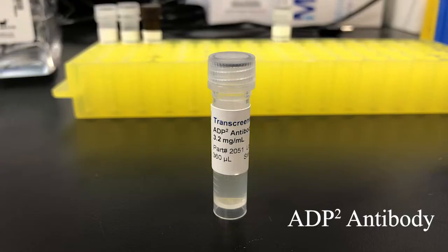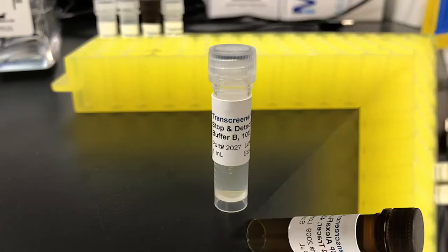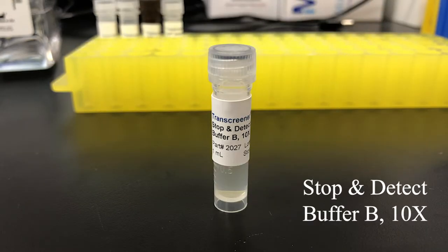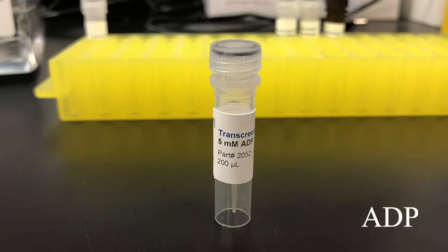Let's discuss what's included in the kit. The ADP antibody: sufficient antibody is included in the kit to complete 1,000 or 10,000 assays at an ATP concentration up to 100 micromolar. You can use up to 1 millimolar ATP with the kit; however, more antibody may be required. ADP Alexa Fluor 633 Tracer — the fluorescent tracer displaced by ADP produced enzymatically. Stop and Detect Buffer B: this will stop enzyme reactions that require magnesium, though this stop buffer may not work for all enzymes. ATP can be used for the enzyme reaction and to create an ADP-ATP standard curve. ADP is used to create the ADP-ATP standard curve.